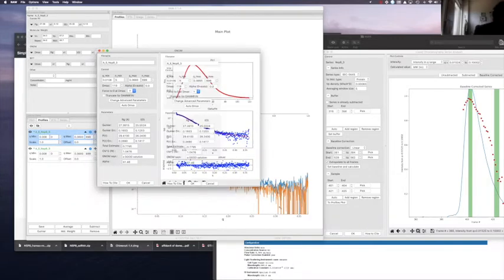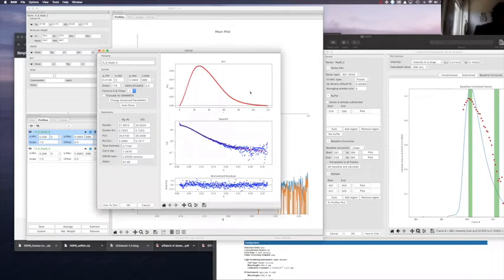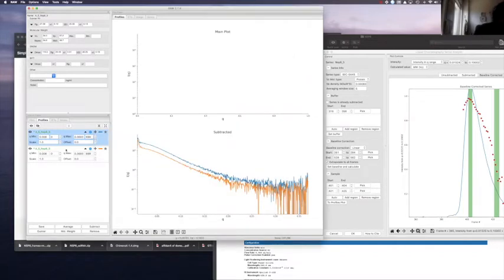So this is a nice P(r) function, going to zero at about 115, and there are some artifacts here, but I think they were excluded. You can also help this a little bit more by removing data points from the beginning, but all well together. It's okay, and the P(r) function is saved.